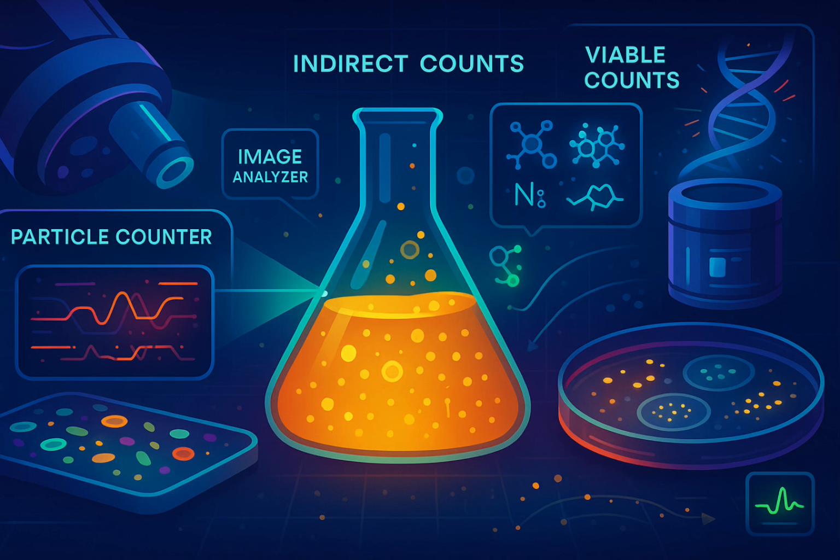Based on the pattern of positive tubes across the dilutions, like all 5 positive at 10^-1, 2 positive at 10^-2, 0 positive at 10^-3, you look up the most probable number in a statistical table. A statistical estimate. When would you use this? It's good for very low concentrations, like water testing, or for microbes that just don't grow nicely on solid agar, some algae, certain bacteria. Advantages? Good for low numbers, conceptually simple. Disadvantages? Low accuracy, it's an estimate, takes time, 24 hours plus for incubation, needs lots of tubes, media, incubator space, labor intensive. The classic fecal coliform test in water is often an MPN.